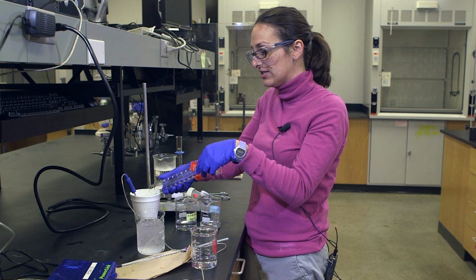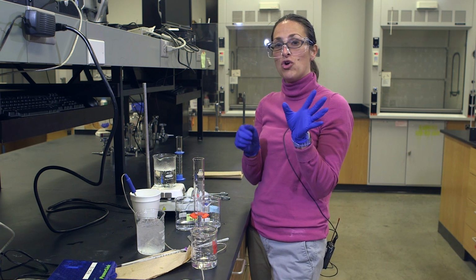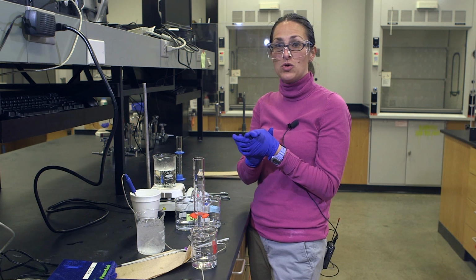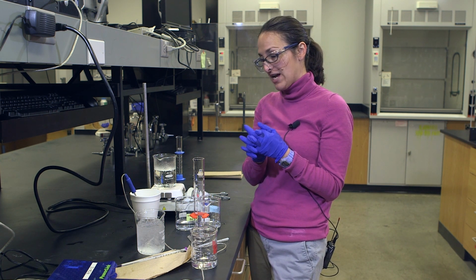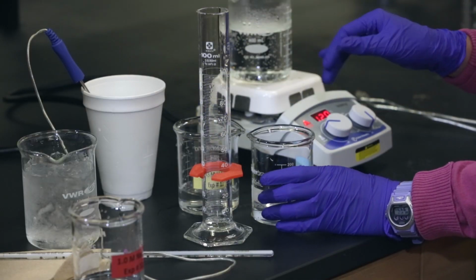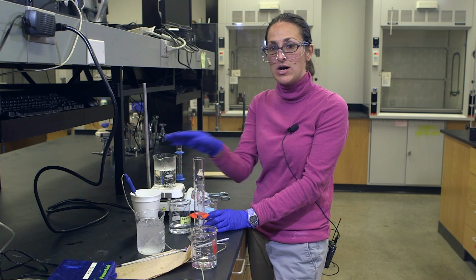And then after I've clicked Start Experiment, or Begin Experiment, I will combine the two equal volumes of strong base and strong acid. And over time, this will equilibrate and we'll get a temperature reading and we'll use that to calculate the enthalpy of that reaction. So again, be really cautious with the hot plate and the strong acids and strong bases. So that's experiments 10 and 11, all about calorimetry.